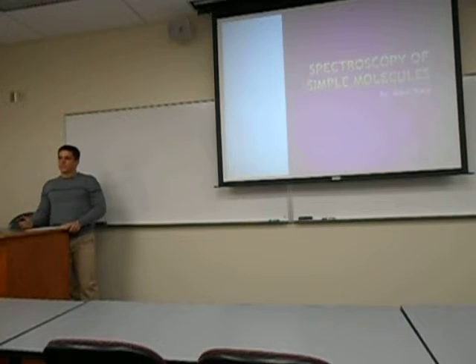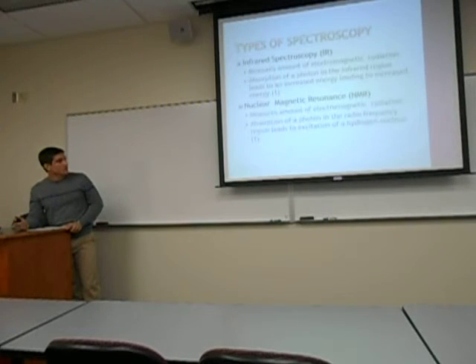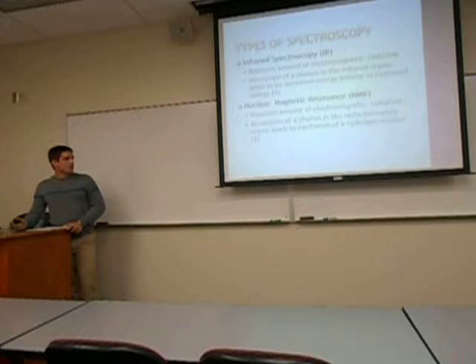Hi, my name is Steve Tracy, and today I'm going to tell you about how to determine simple molecules in a water sample. The instruments used to determine this are infrared spectrometers and nuclear magnetic resonance, which can be abbreviated IR and NMR.